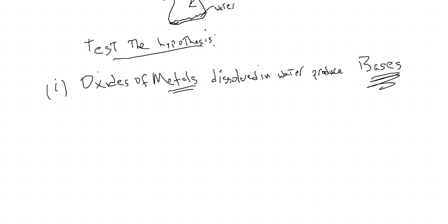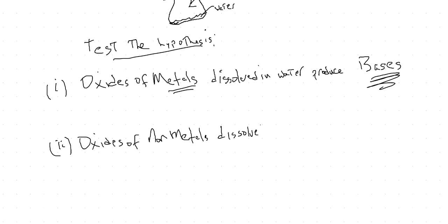Our other hypothesis is that oxides of nonmetals dissolved in water produce, you probably guessed, acids. Okay, so that's our experiment. We're going to play with that.